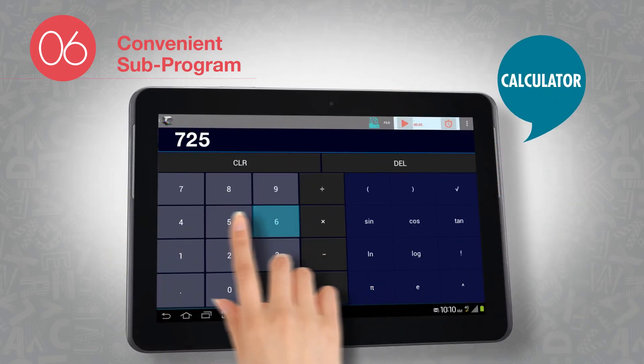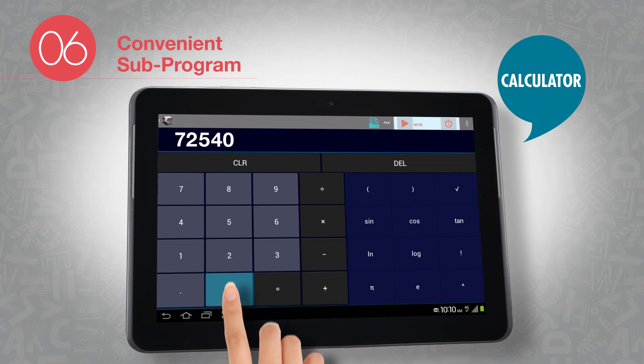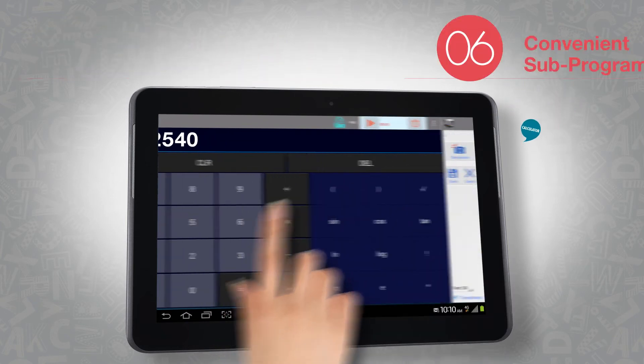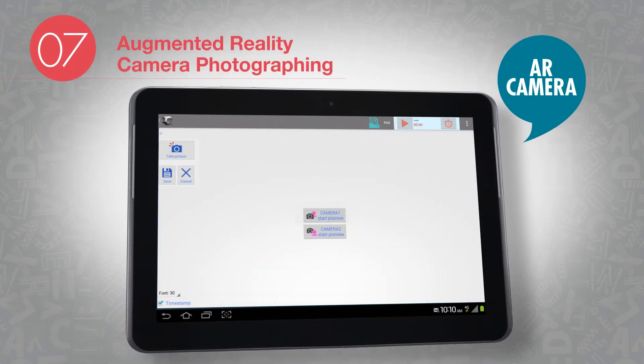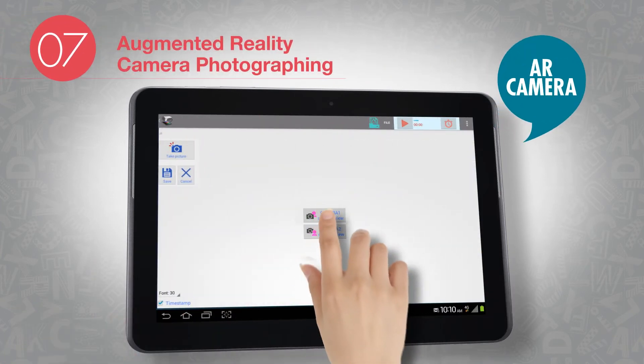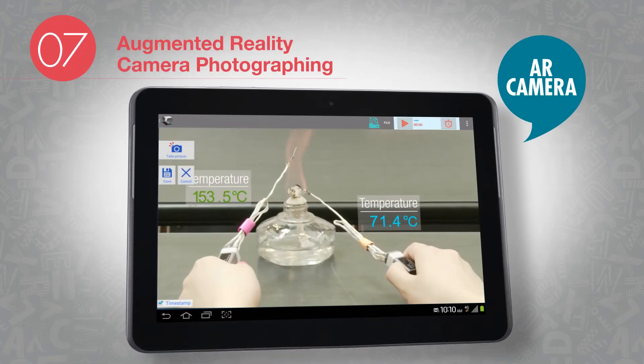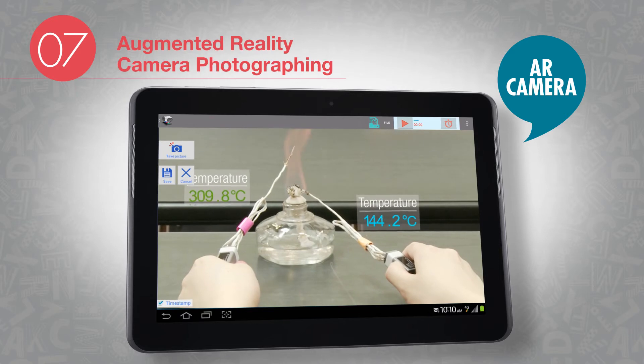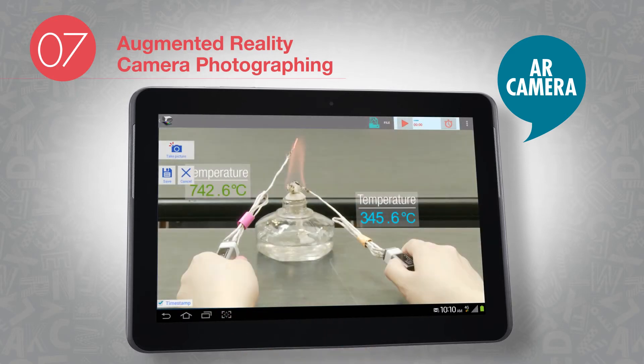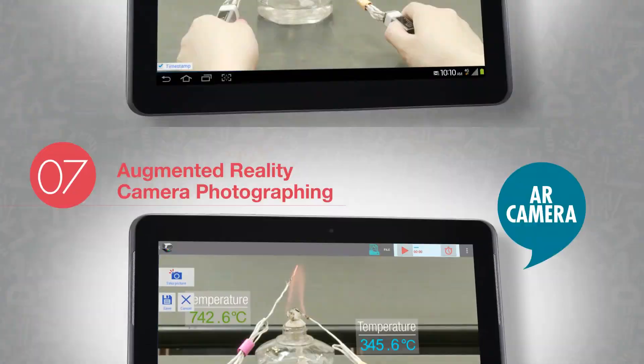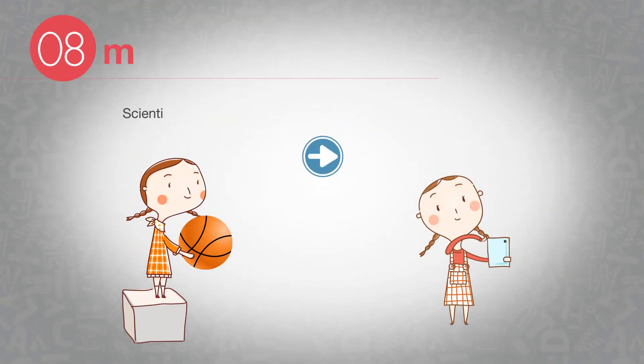You can also add up the calculation function for easy computation. In AR camera function, students can get a special experience of seeing the sensor's name and measured values displayed on the screen at the same time.